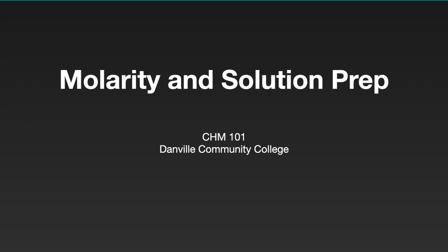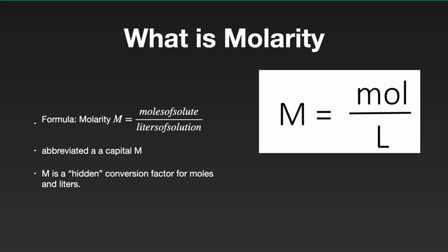Welcome back. In this video, we're going to talk about molarity, the unit of concentration most commonly used by chemists, and how we use special glassware in the lab to prepare accurate solutions.